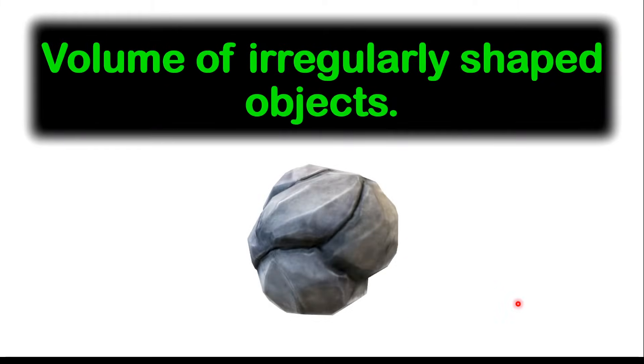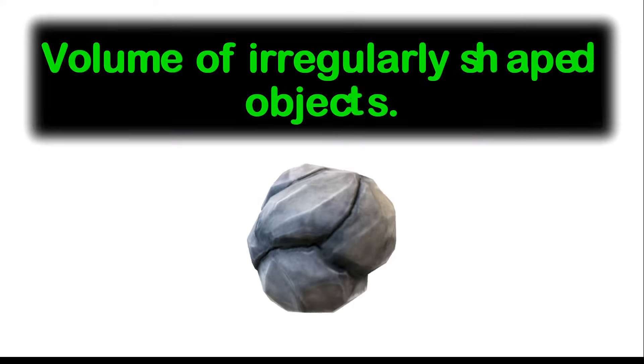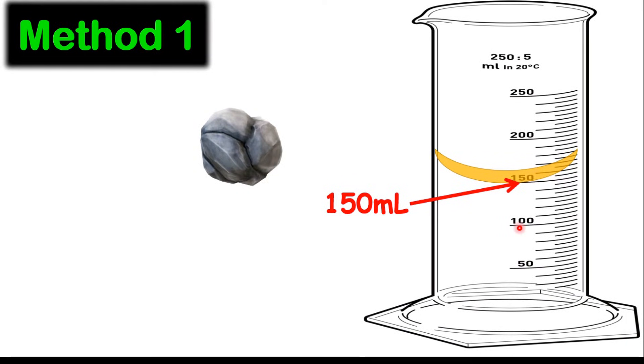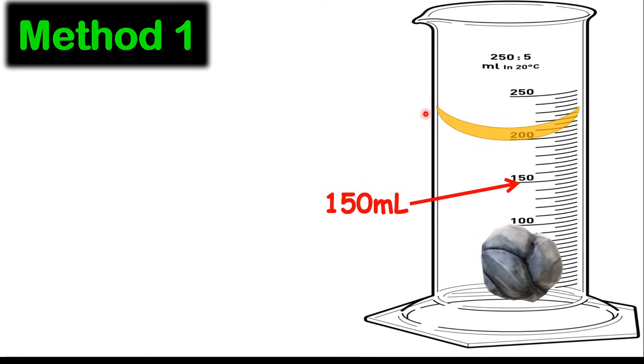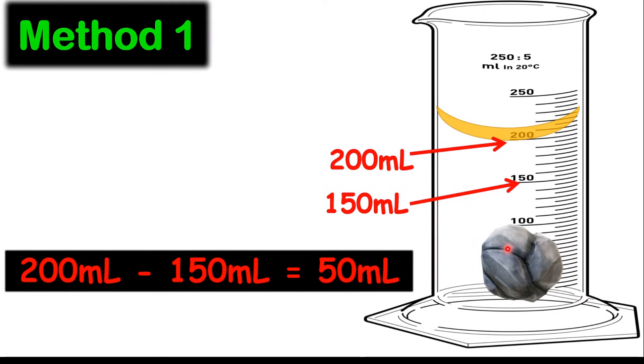To measure the volume of irregularly shaped objects, it's very difficult to measure the length times width times height or even measure radius. For example, if you have a stone, it's not regularly shaped. In method one, we pour some liquid into a measuring cylinder and take that measurement. For example, this measurement is 150 mL. Next, put this carefully into your measuring cylinder. Notice the volume starts to rise, and now our new volume is 200 mL. To calculate the volume of this rock, we take away the first volume from the final volume. Hence, we'll have 50 mL for that rock.